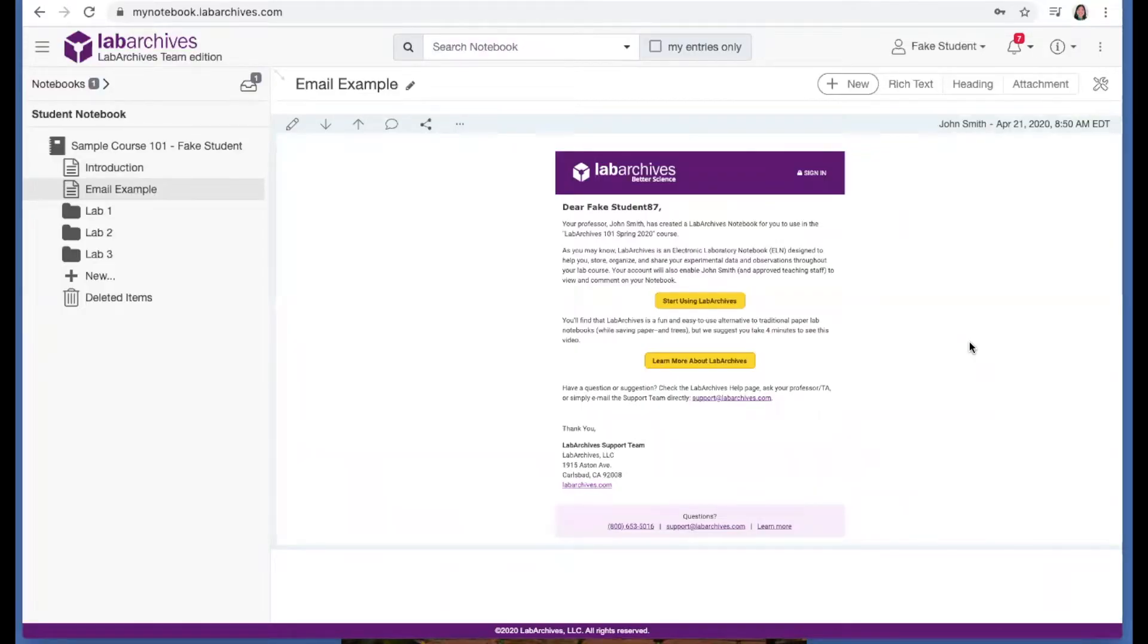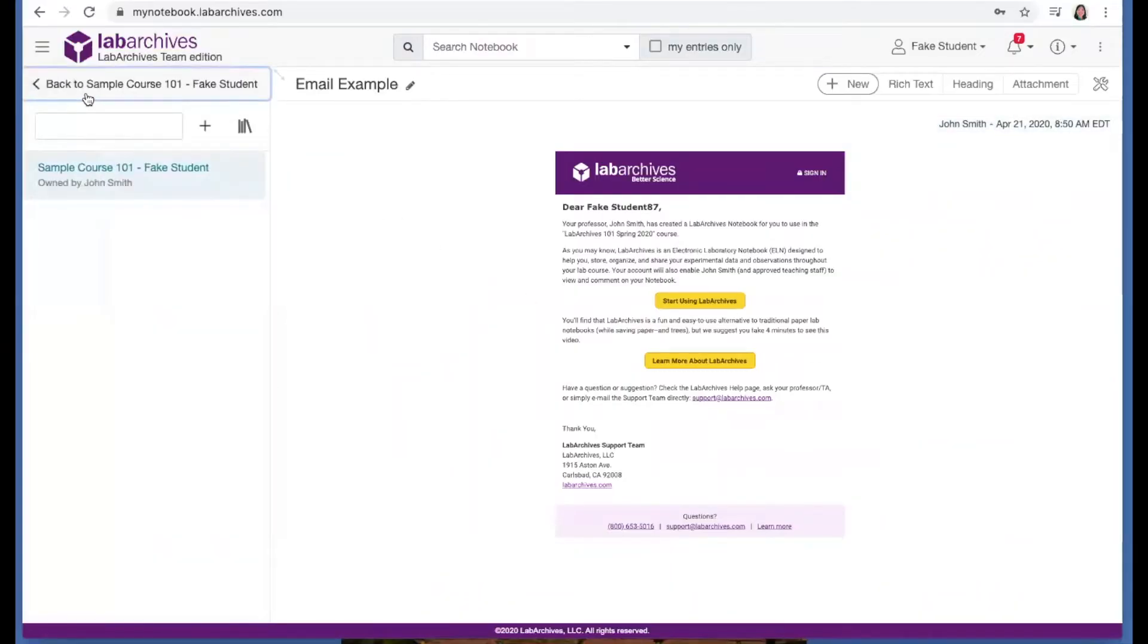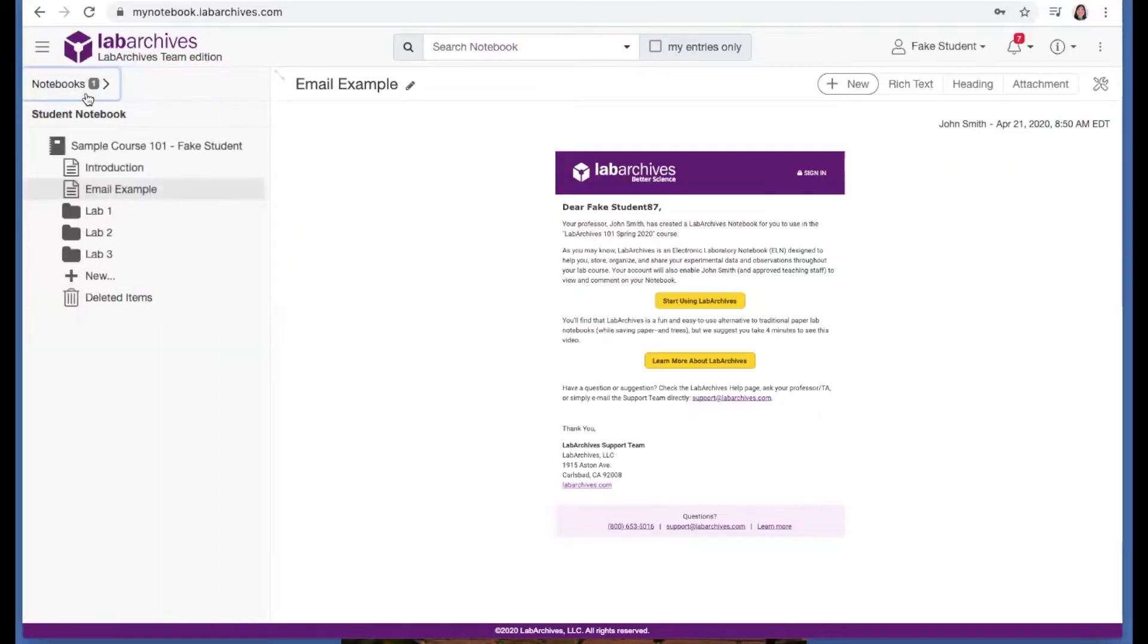If you're using LabArchives for multiple courses, you can click this Notebooks button up here to bring up a list of all the notebooks that you have access to.